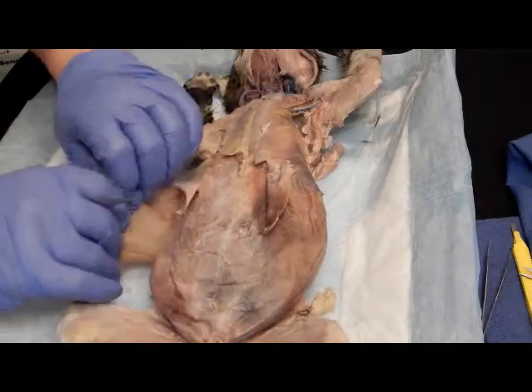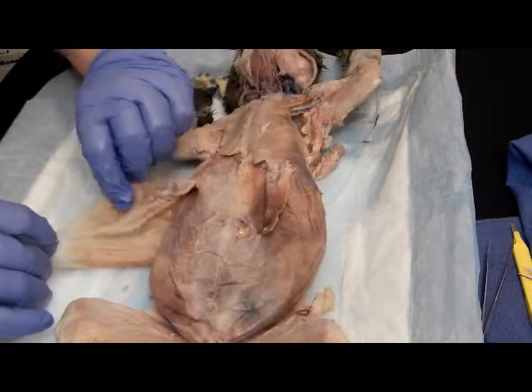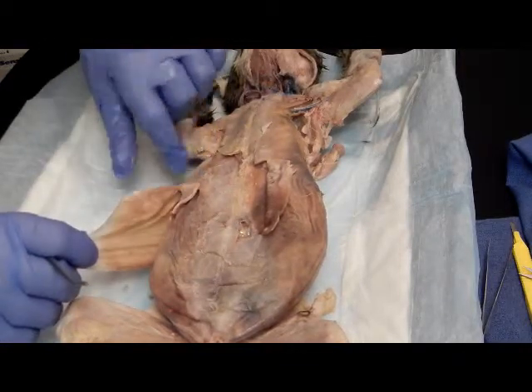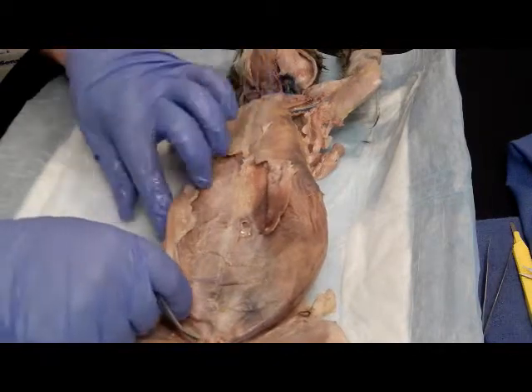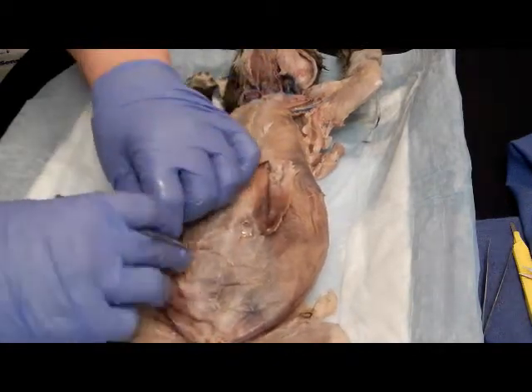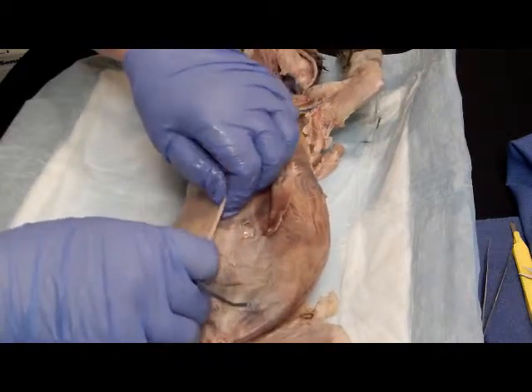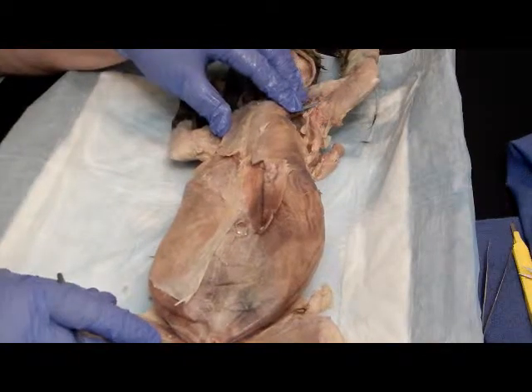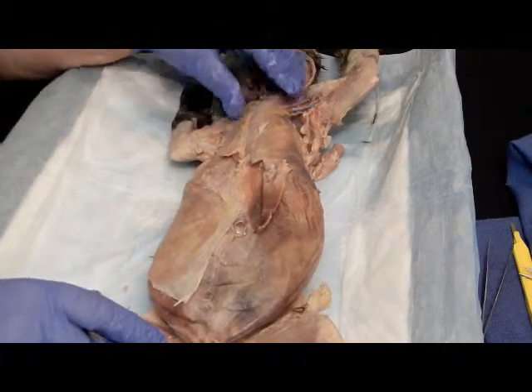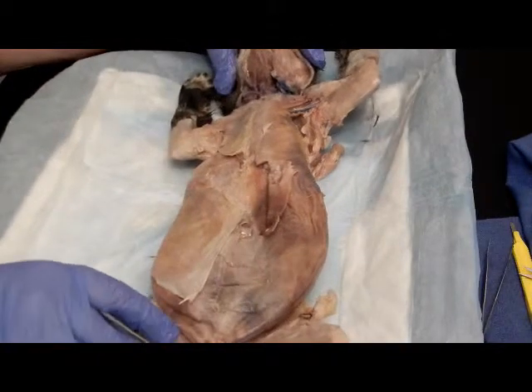The external obliques, its origin are by fleshy strips from the outer surface of the 8 ribs. Most fibers insert into the linea alba via broad band aponeurosis, and some insert into the pubic crest and tubercle and the iliac crest. Its function is to flex vertebral column and compress abdominal wall, aids the muscles of the back in rotating trunk and flexing laterally.